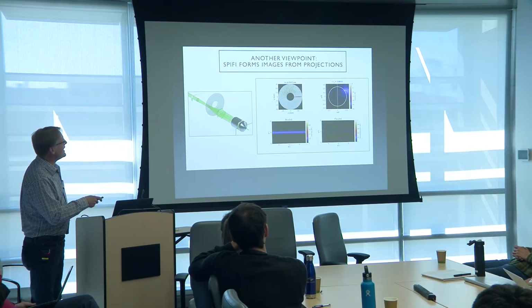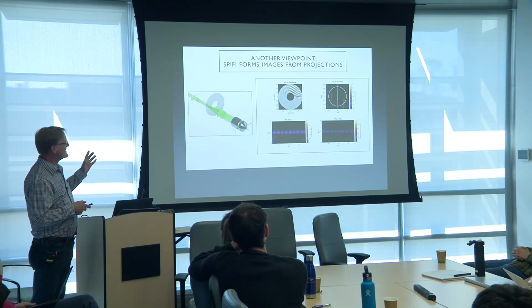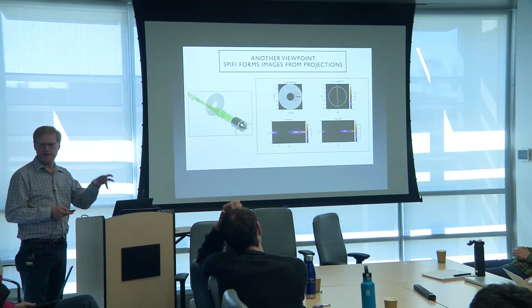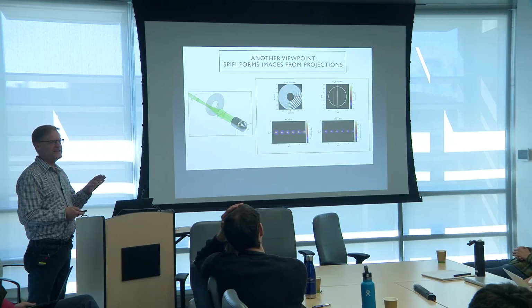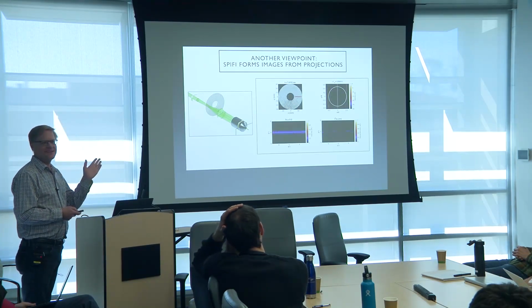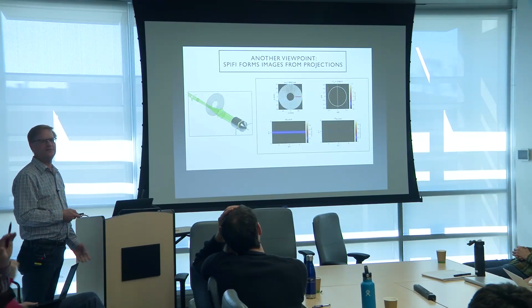So you can really see at the back the light sheets and how they are producing these spatial frequencies that are varying as a function of time. So that's why it's called spatial frequency projection modulation imaging. I mean, it's kind of the worst acronym ever because it's spiffy, but it doesn't add up correctly according to our rules of acronyms, like FROG does, but yeah.